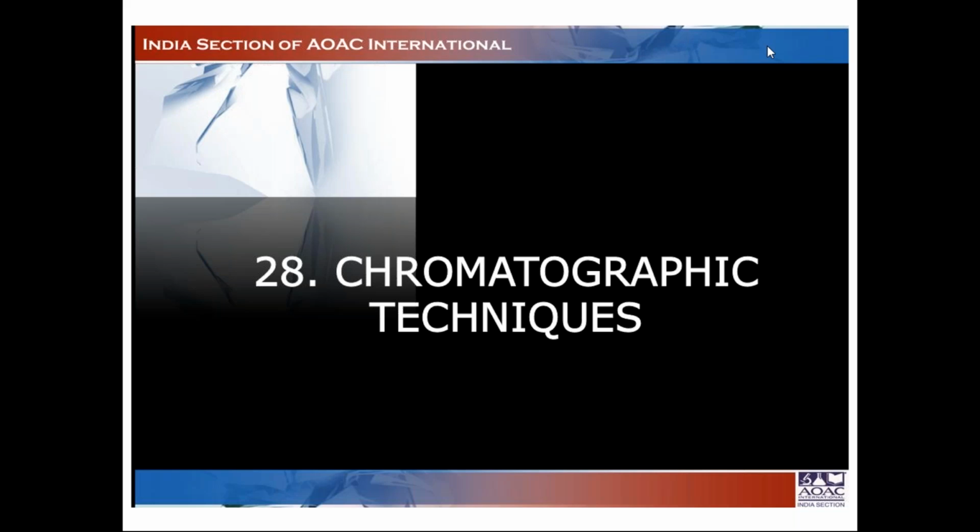So, if we start with chromatographic techniques, first let us understand what chromatography is and what the basics of chromatography techniques are, whether it is planar chromatography, that is paper and TLC, or column chromatography, which involves both high performance liquid chromatography and gas chromatography.